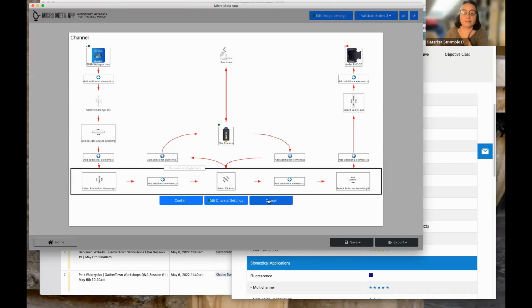But unfortunately, not everything is. And as you know, different manufacturers provide different subsets of the fields. Yeah, and they have different names. But we are using Bio-Formats to map that as much as possible, because they've done a great job at helping us map it. So we're not starting from scratch.